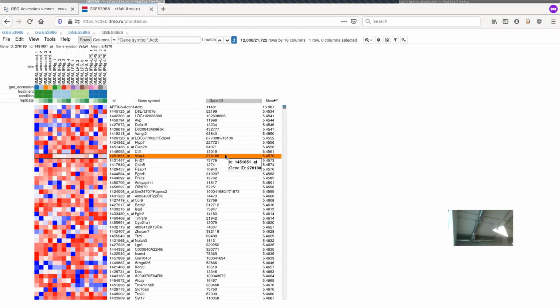Can get more robust, and usually you can get even more genes if you have a diverse dataset, like a cancer dataset, for example, with a big cohort of cancer samples, which are very diverse, and the different genes can be expressed in different samples. But on average, around 10 or 12K, or 15K for these cancer samples, these are the numbers that we usually use.